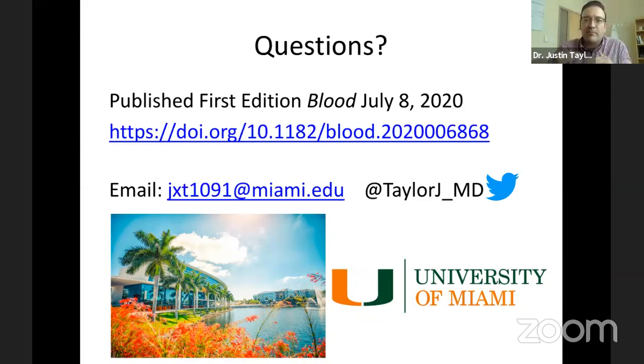So we tried to model different methods, and that's explained in the paper, to basically look at the co-occurrence, making different presumptions, presuming if there was one mutation there, that it was a heterozygous mutation and not homozygous. And for those reasons that I just explained, I think it was a pretty safe assumption. So it's not insurmountable.